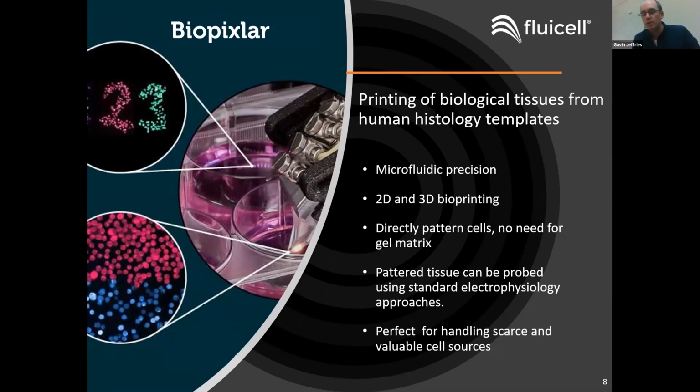This can work in 2D and 3D, but one of the big separating factors of this technique, particularly relevant for electrophysiology or other probing techniques, is that this can be done in the liquid environment. We don't need to have anything covering the cells. In other words, as soon as the cells sit down and are happy and maybe stretching out, they can then be interrogated directly. You can use external probes. They can be connected with patch pipettes, for example. So this is very amenable to other electrophysiological and probing techniques.